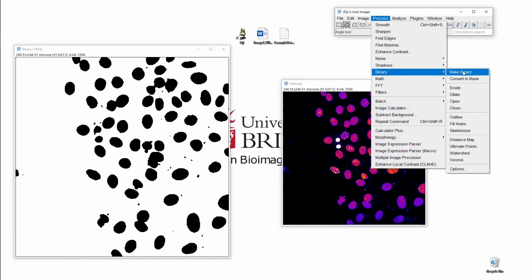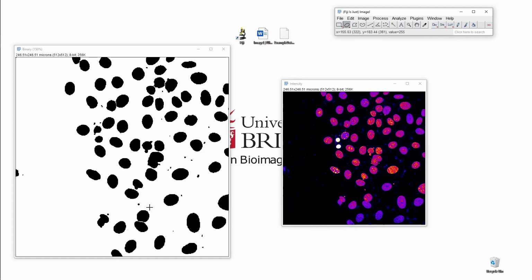The other process we're going to do is to run the watershed. So this has split down a lot of these, however it has missed off this one. And it's kind of the fact of image analysis and automated image analysis like this that you're never going to get 100% perfect results, so we just kind of have to live with it. We could try and optimize it a bit further. We could also try and use different processes. Like I say, the watershed here is using a distance-based watershed. However, there are more complicated versions using intensity-based watersheds that we could use. However, that's kind of beyond the scope of what we're trying to do here, but it is something you could look up if you were interested.